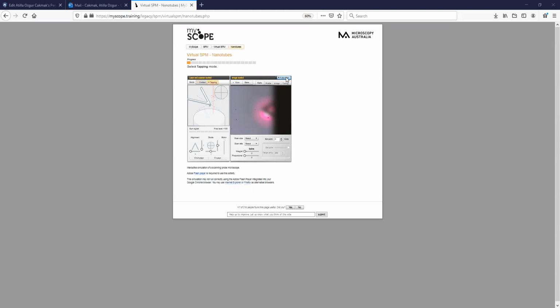features. So like you can see, we need to align the laser. So we'll follow the steps one by one. We'll put the laser on the cantilever beam so that we can get the laser shining to the mid spot of the photodetectors. We'll use the diode X and Y to put the beam in the midpoint like this. So now we'll tune the target amplitude to 500 millivolts. As you can see, the vendor company suggests that information.